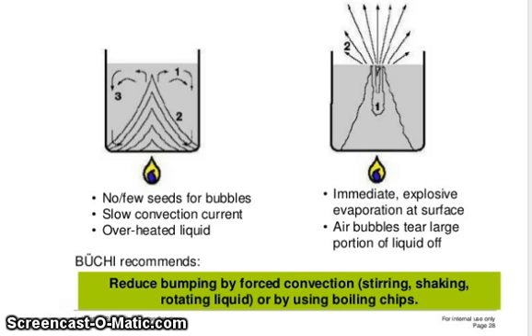With no or few seed bubbles, there is slow convection current and overheated liquid, leading to immediately explosive evaporation at the surface — air bubbles tear a large portion of liquid off. Reduce bumping by forced convection through stirring, shaking, rotating the liquid, or by using boiling chips.